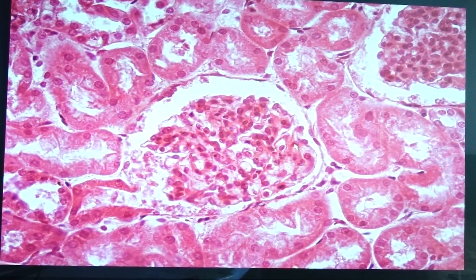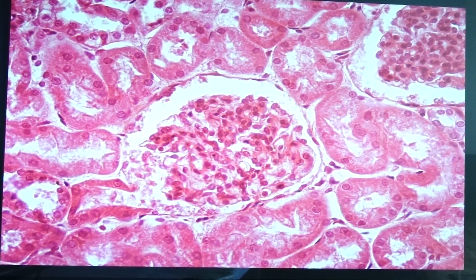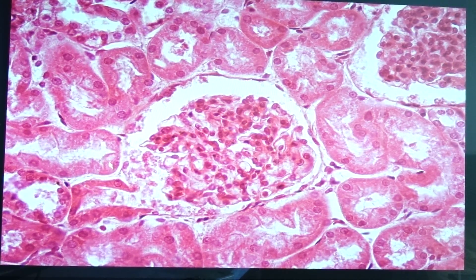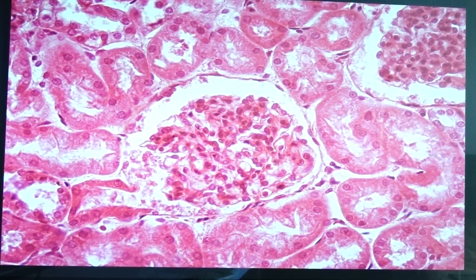The glomerulus would be a nodular structure composed of several tufts of capillaries — around 10 to 20 capillary loops in a glomerulus. This is surrounded by a capsule which we call the Bowman's capsule. The Bowman's capsule is lined by simple squamous cells which we call the parietal epithelial cells.